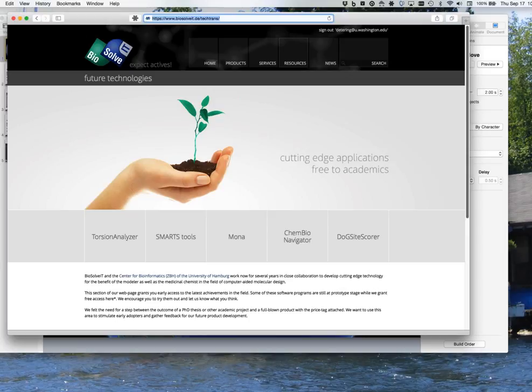But then, on the other hand, if you look at these EDIA values, there are some water molecules which are really well resolved in the crystal structure. If you take multiple structures, like you can do now with the ASCONA and SIENA approach, you can even check in how many structures water molecules are available. And then you can get a feeling about the importance of a water molecule for binding. And then it sometimes makes sense to selectively keep water molecules in these experiments.